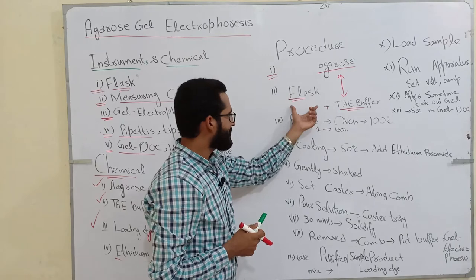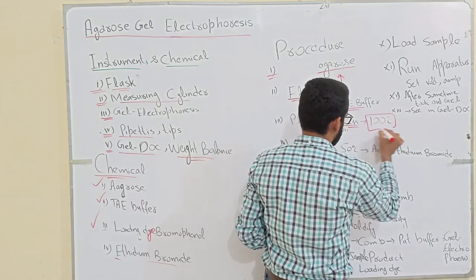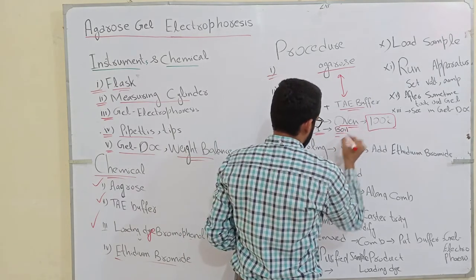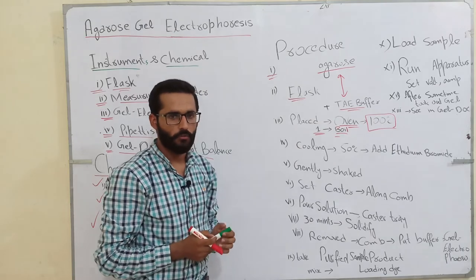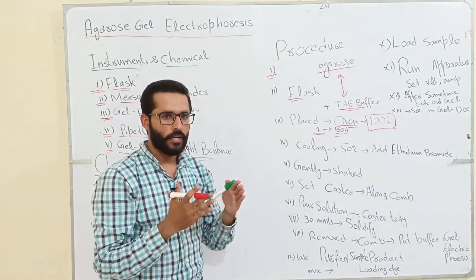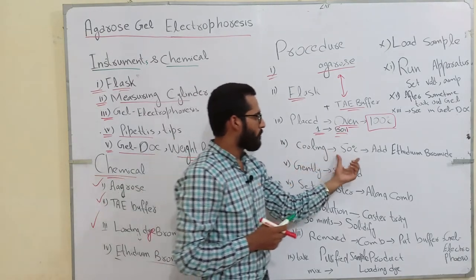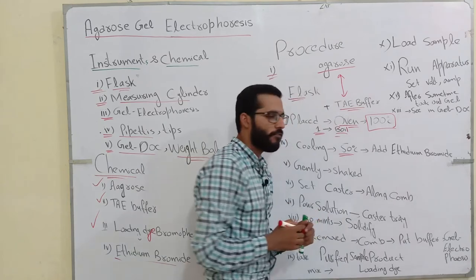Then we place this flask into the oven at 100 degrees centigrade for 1 minute. When the solution in the flask starts to boil, we remove it from the oven and put it on the table for some time so that the temperature of the agarose solution cools down. After cooling, when the temperature has come down to 50 to 55 degrees centigrade, then we add ethidium bromide.